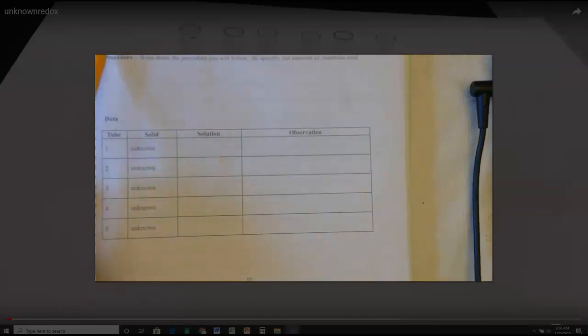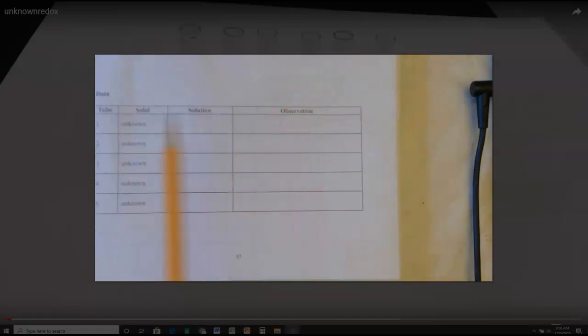We're going to put them in copper nitrate, zinc nitrate, nickel, silver, lead, and we're going to write down whether or not we see a reaction occurring.